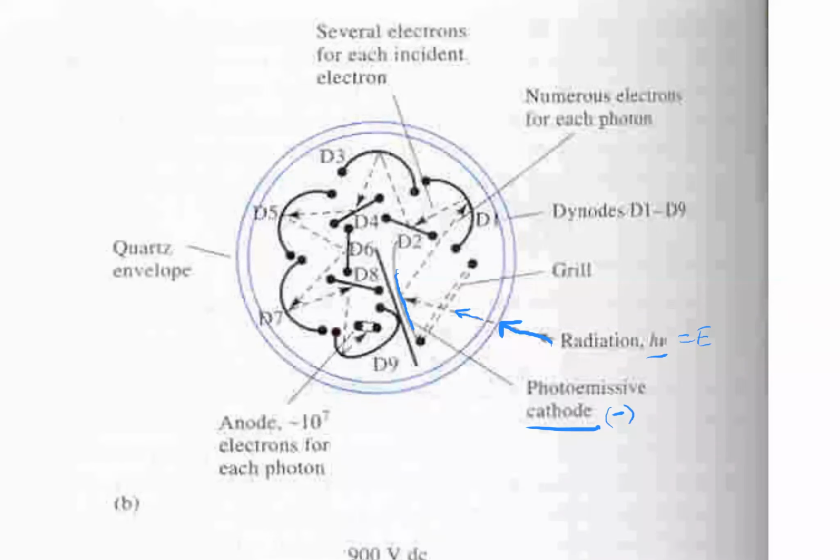It's a photoemissive cathode, so again, it's made from a material that's easily ionizable, and we can make M+ and e-, with e- being our electron. So we coat that cathode with a material that's easy to ionize. If light comes in and it strikes that cathode, electrons will be produced, just like the phototube.